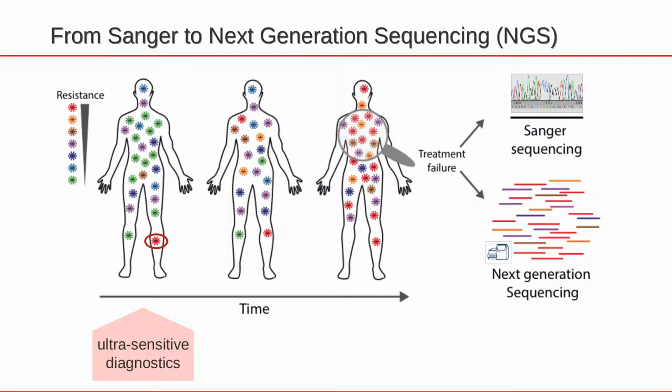These might be resistance to a drug, or, as discussed in the literature about SARS-CoV-2, that might be a change of a receptor. Over time, such a variant can be selected for and take over the viral population up until the point at which its impacts can be seen on the host. Traditional sequencing methods can only show an overview. They cannot show the diversity which is happening inside the host.